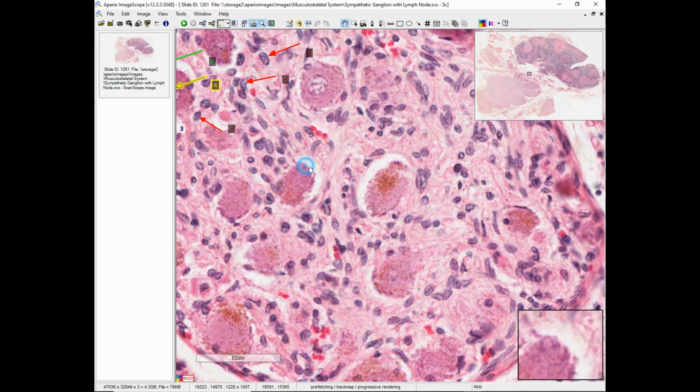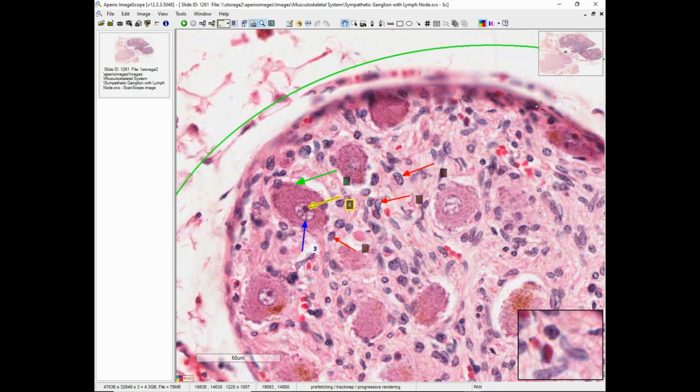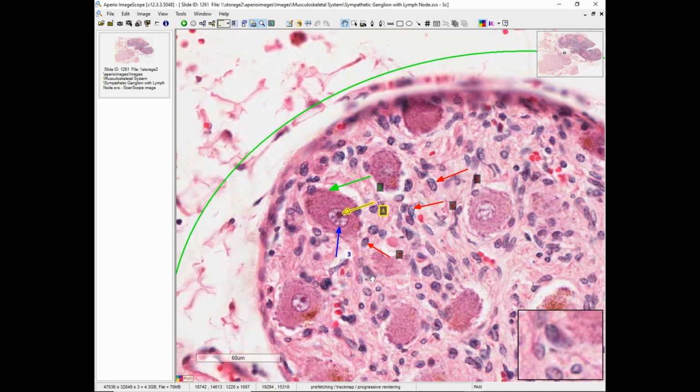So now let's jump back up here, and we can see the self-quizzing area. Just take a look at these arrows. You can see here that the small red arrows associated with number 1 are pointing to the very small cells that are nearby.